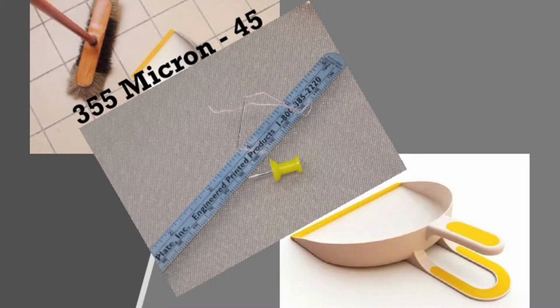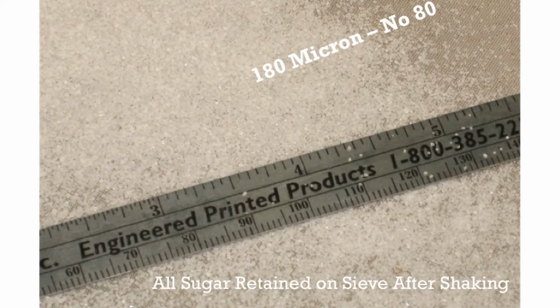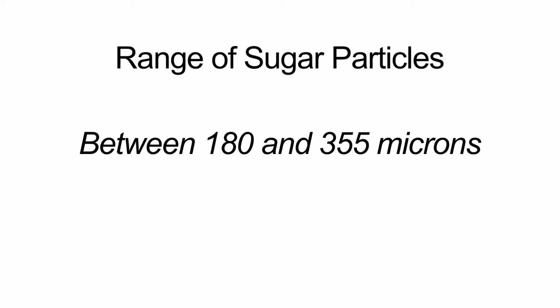These results tell us that sugar particles were all smaller than 355 microns, that some were larger than the 250 microns, and that none were smaller than the 180 microns. So the range of the sugar particles were between 180 microns and 355 microns.